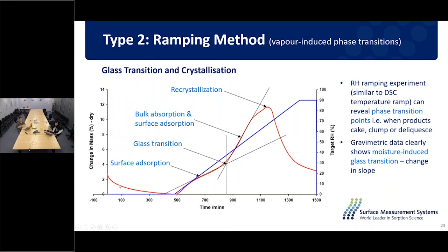the flow of the carrier gas removing any free water on the structure. And then when we begin introducing the humidity, the sample picks up the humidity slowly, because the water is only adsorbed on the surface of the material.